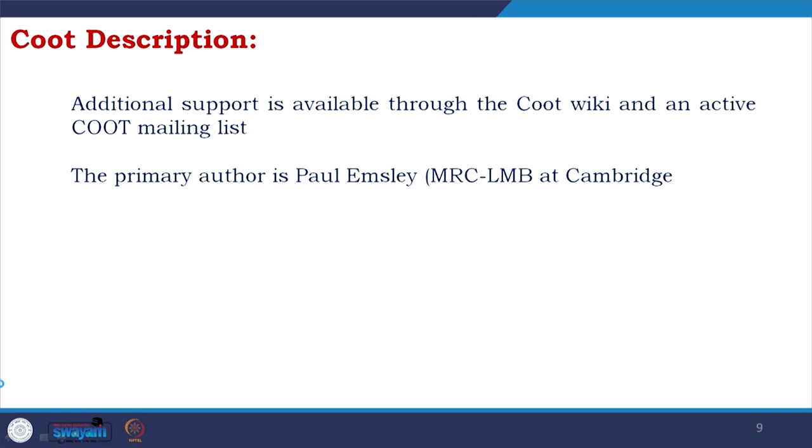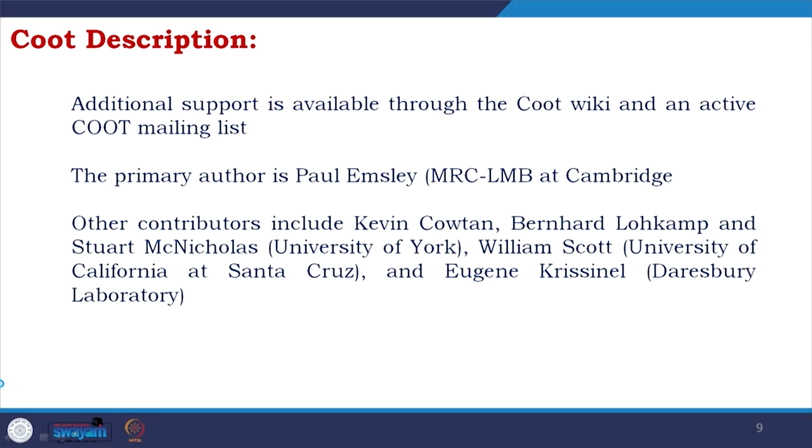As I told, the primary author is Paul Emsley. Other contributors include Kevin Cowtan, Bernhard Lohkamp and Stuart McNicholas, University of York, William Scott, University of California at Santa Cruz, and Eugene Krissinel, Daresbury Laboratory.